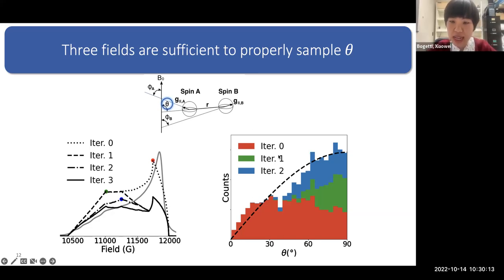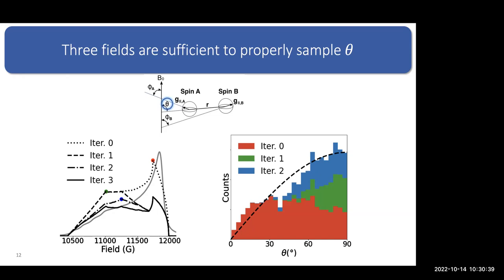This theoretical calculation just assumes the pump and observer are always 100 megahertz apart, which probably works with most commercially available resonators. But if you have a better bandwidth resonator, let's say 400 megahertz or 800 megahertz, you might need fewer and fewer measurements. Okay, thank you. No problem.